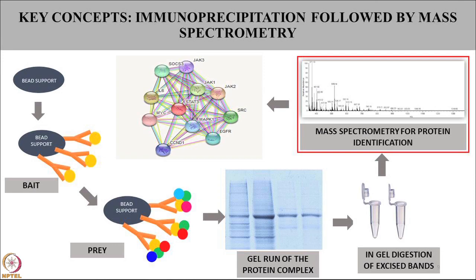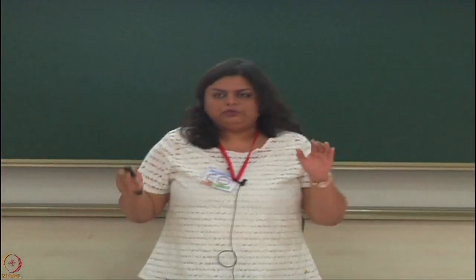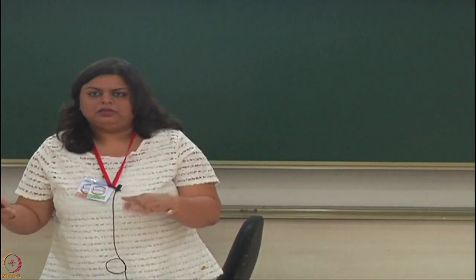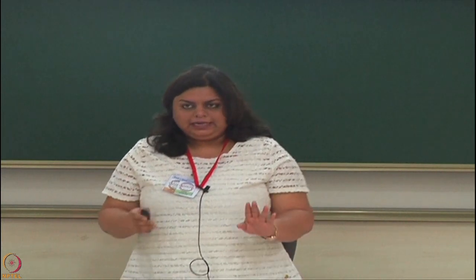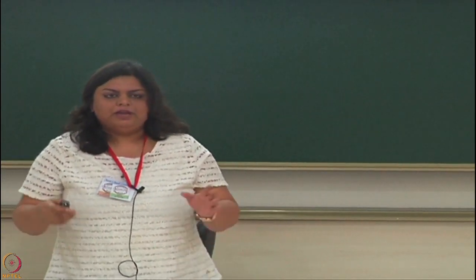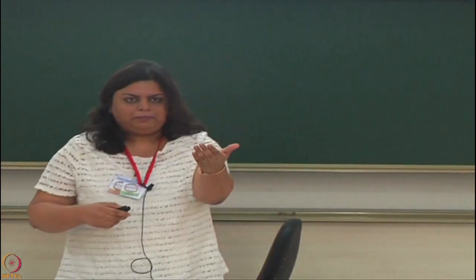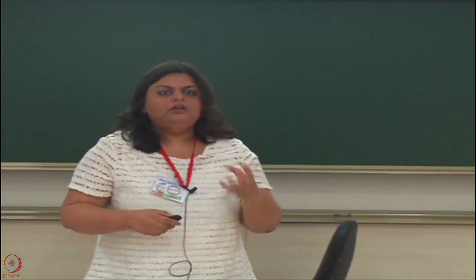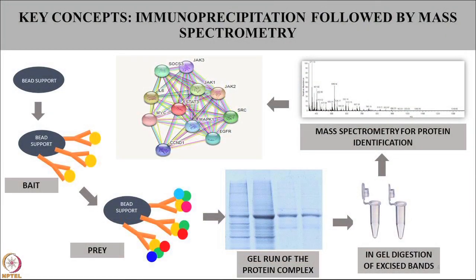You can exactly know which molecular weight regions you are looking at, and you can go back to the database. You can look at your identified proteins on the mass spec, and you can know how relevant your hits are, whether at all they are interacting partners of STAT3. Rather than doing a global proteomics, like many of you are familiar with, wherein you are identifying everything, now, just the way you can enrich your PTM, you can enrich your sample to look at a particular complex. So this is the overall methodology.